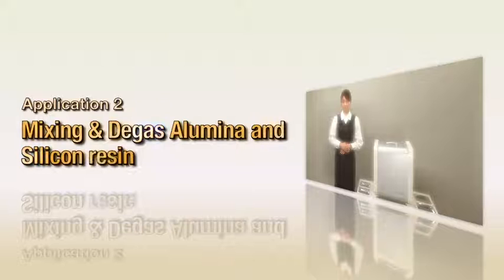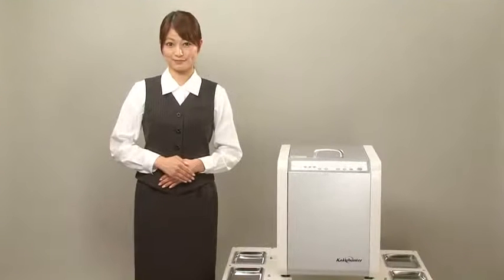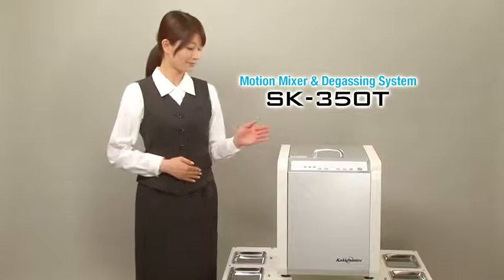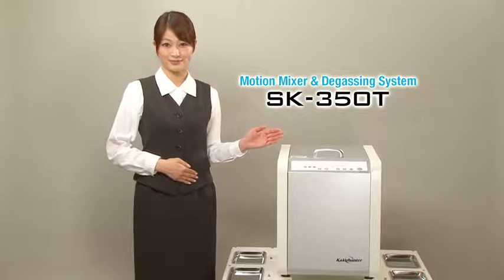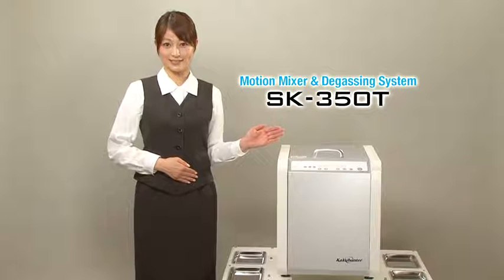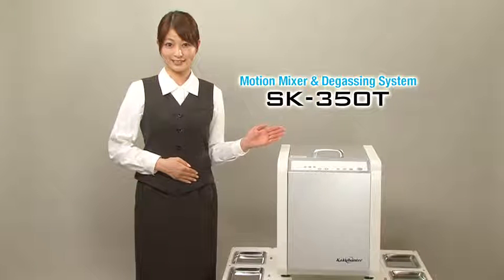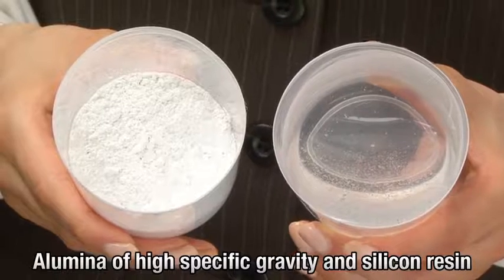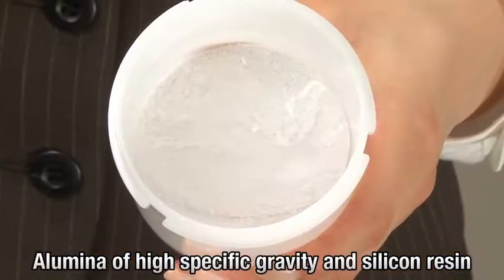Mixing and degassing alumina and silicon resin. Next, we will use the SK350T in step mode in order to mix powder and resin into a paste and degass the material. First, we prepare the materials — we are using alumina of high specific gravity and silicon resin.